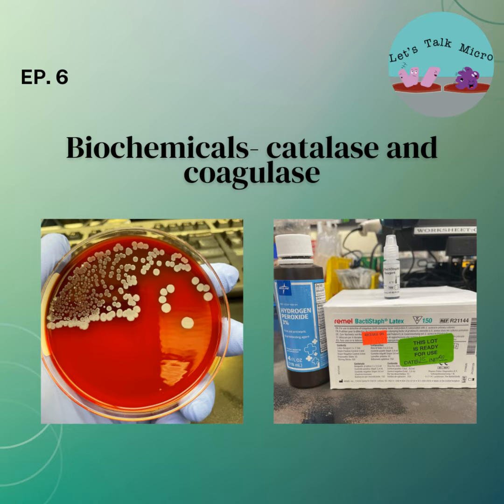But this is one of the main biochemicals that differentiates Staphylococcus from Streptococcus. So, what's a positive reaction? A positive reaction is when bubbles are produced, and that's the release of the oxygen. Like I mentioned, that enzyme catalyzes the release of water and oxygen from hydrogen peroxide. So the oxygen being released is the bubbles that you see.